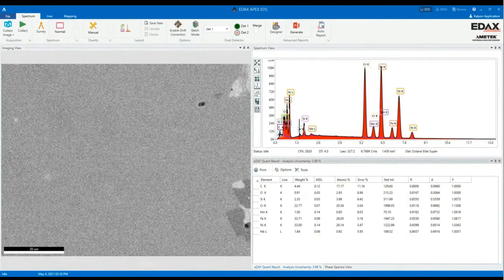In this tab, we can select the parameters we want to see in the bottom. So we can click on some parameters we are interested in. And when we click on OK, the parameters will be shown in the bottom. In the tab Administration, we are able to activate the multi-user mode. So the user is able to work with the software with different people. So by clicking OK.